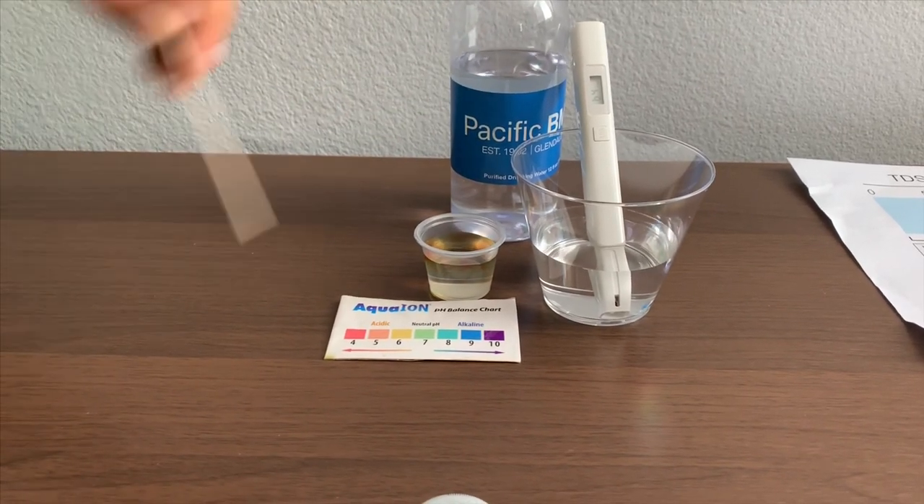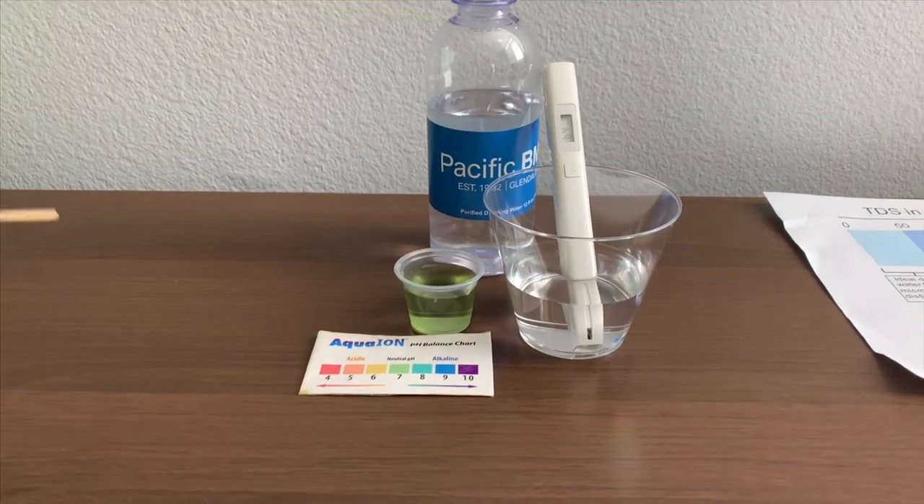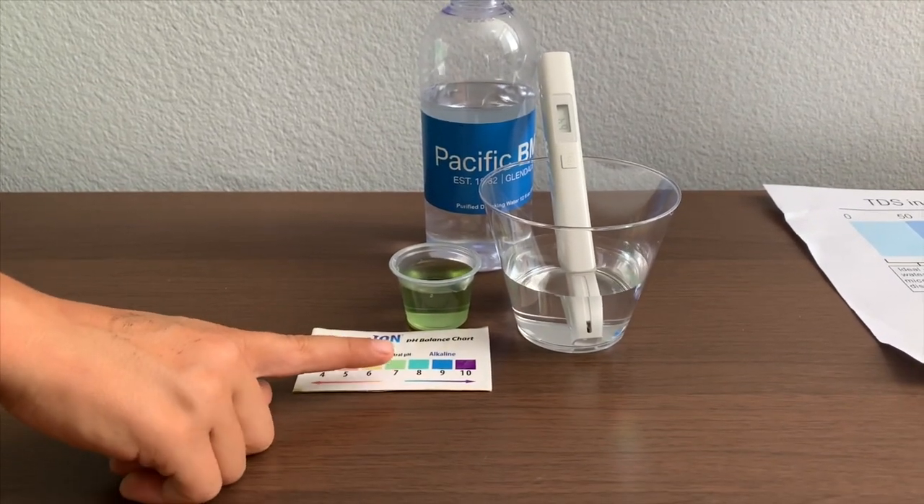Let's stir it for a better result. I give this a 7 — this is a neutral pH.